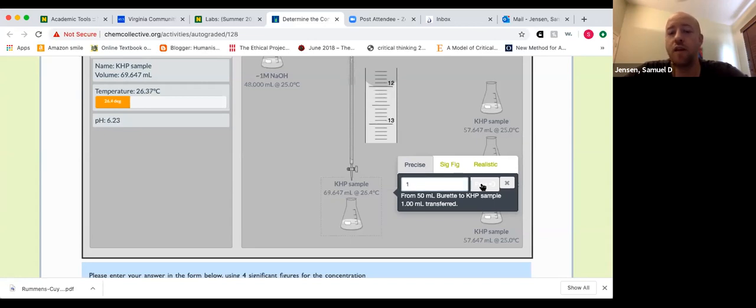Now, presumably, if we were in the lab, there would be some point where people catch on that they did something wrong because nothing happens, and then I get the raised hands of, Dr. Jensen, nothing happened and we've emptied out our burette. Then I have to go back to the fact that if it gets down towards the end, at the 50 milliliter mark, don't keep going.